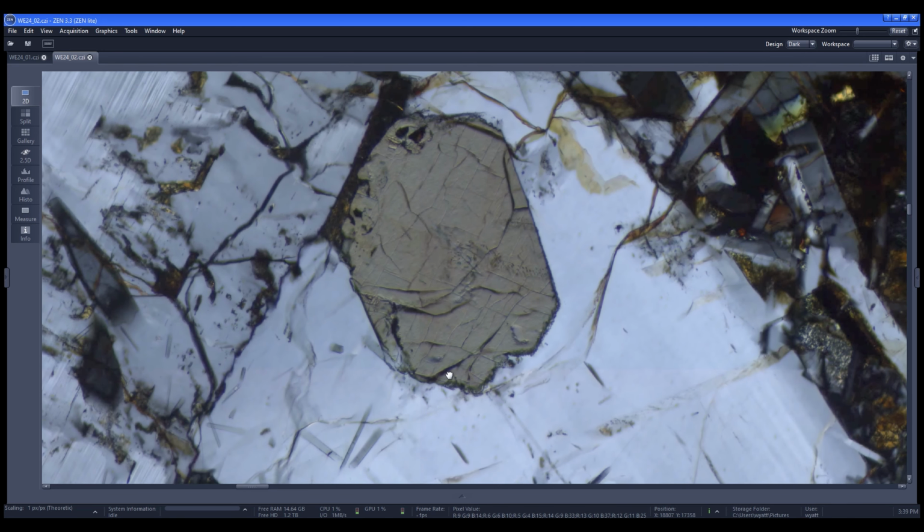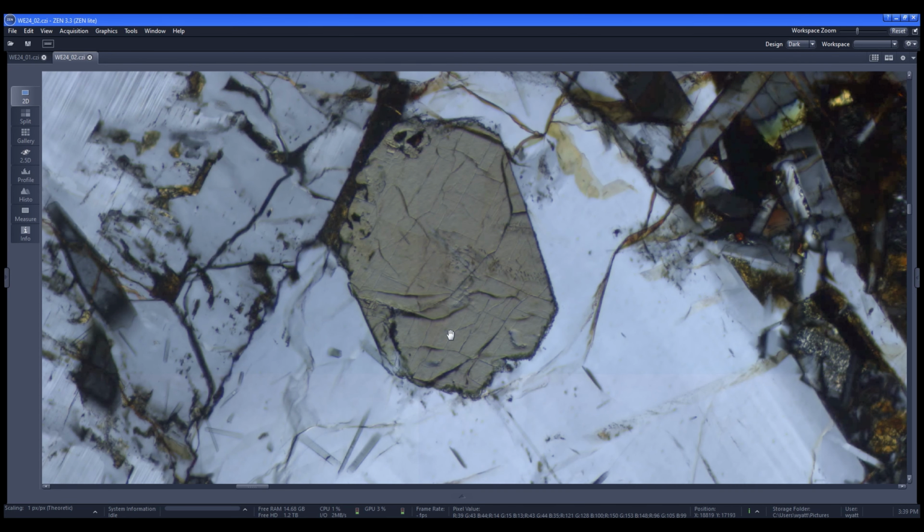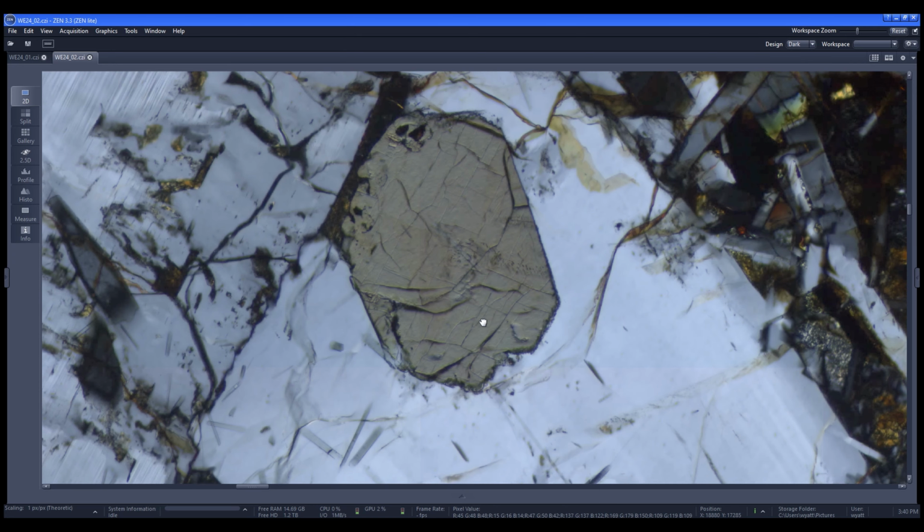And it's also possible for something to have a lower relief to the glass. But that would be like a negative or positive relief, depending. And that's something you can test for in a microscope. It's a lot easier. You can't do it in this.